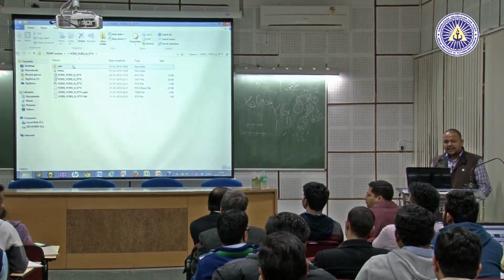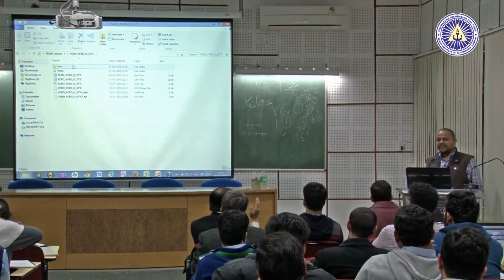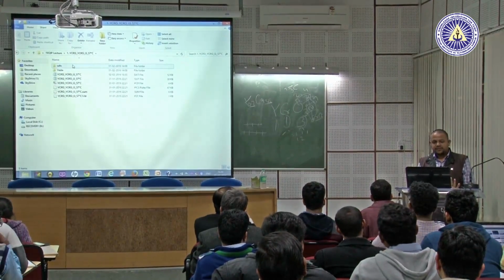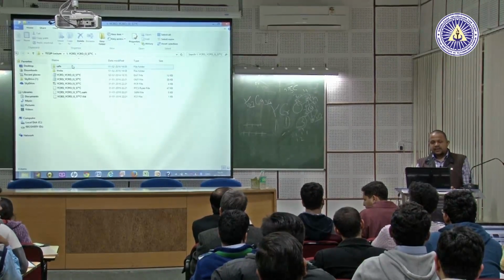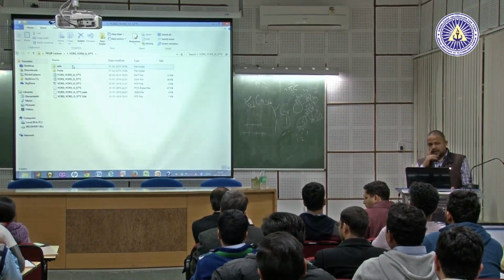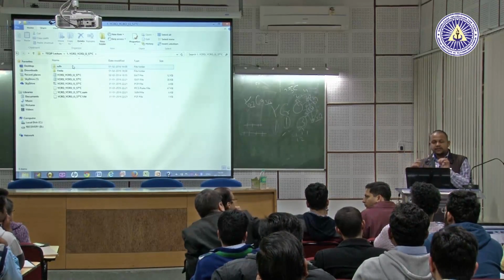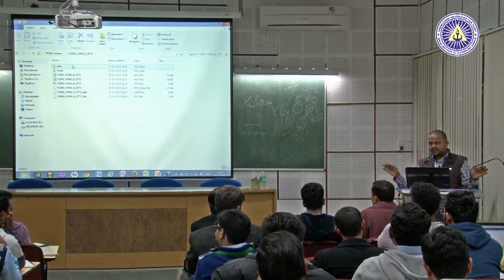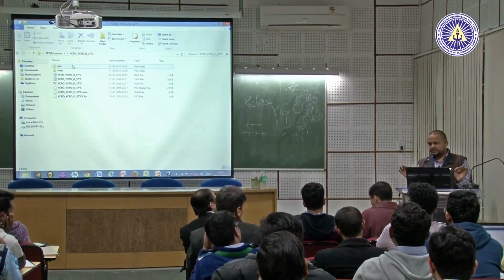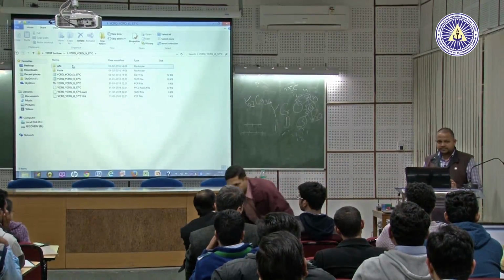Your first guess, like yesterday Professor Garg mentioned, I told that I have the information my material is pure phase. It depends upon the range also. The database is for 1 to 120, or I did 20 to 80. This mismatch may come out from that cause.